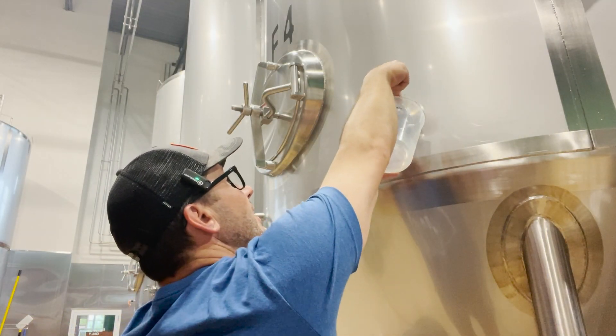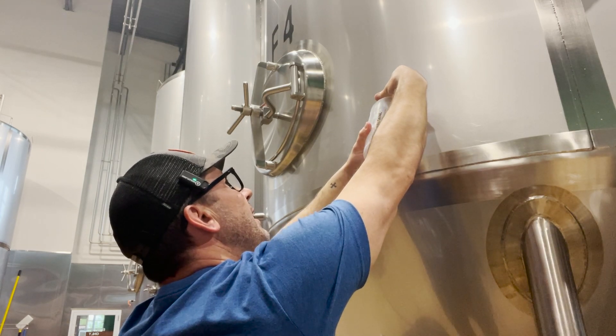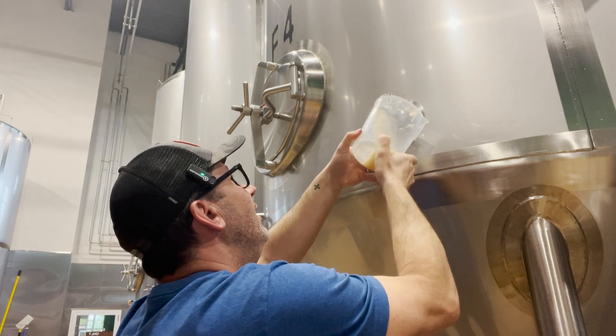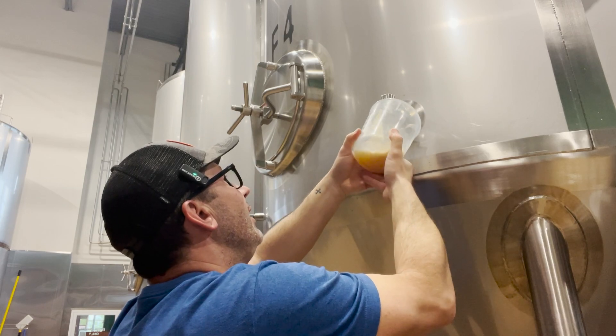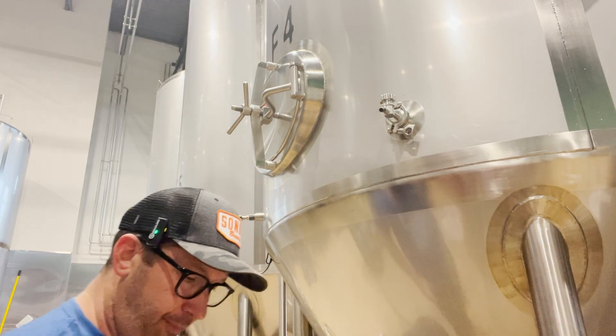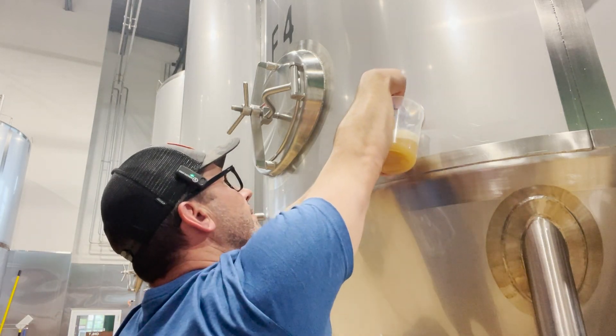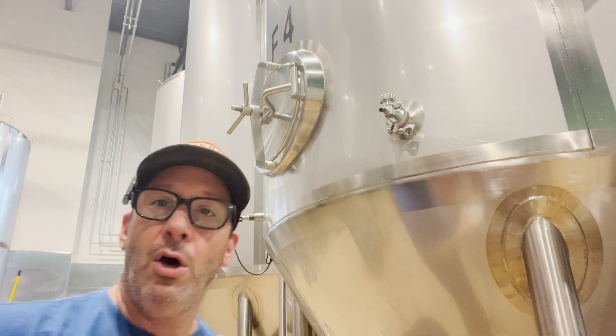I'm over here at tank four, which I need to take my sample on. I'm going to crack the sample valve and you're going to see me rinse the outer edge of this container just to make sure we have all the water out of it. I'm going to dump this small sample and then take my actual sample off of the tank. After I take a sample like this, I'll come back and spray it down with water and then hit it with some alcohol. Let's head back to the lab.